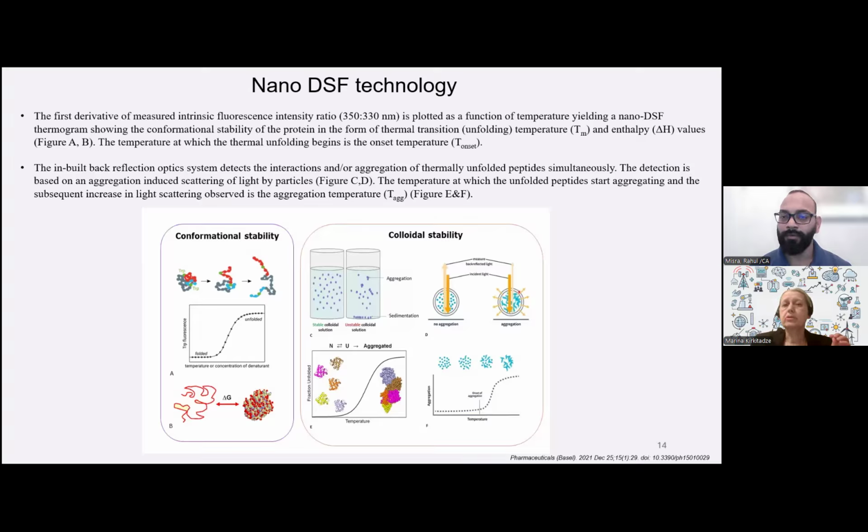At the melting you see a very sharp peak, and it's not smooth or bell shaped, but kind of abrupt. You can only state from experience that that's what happens, but here you have a digital representation. That's a big difference with decision making.